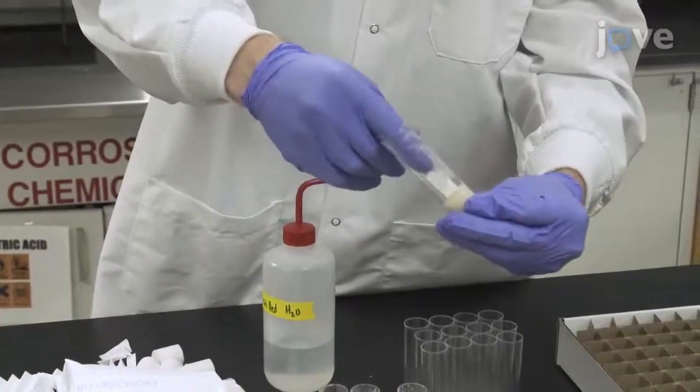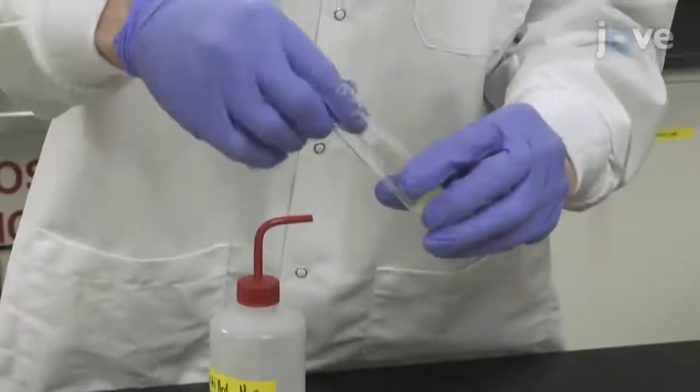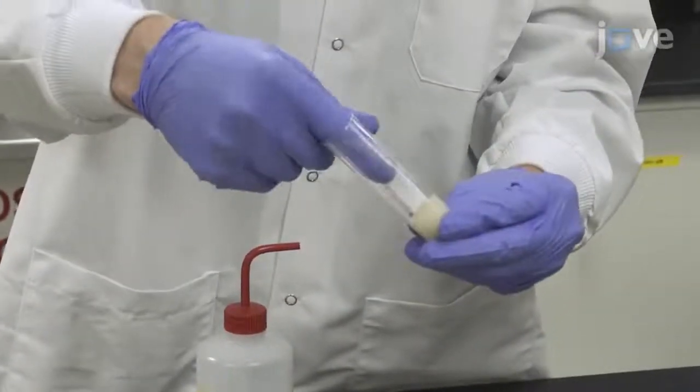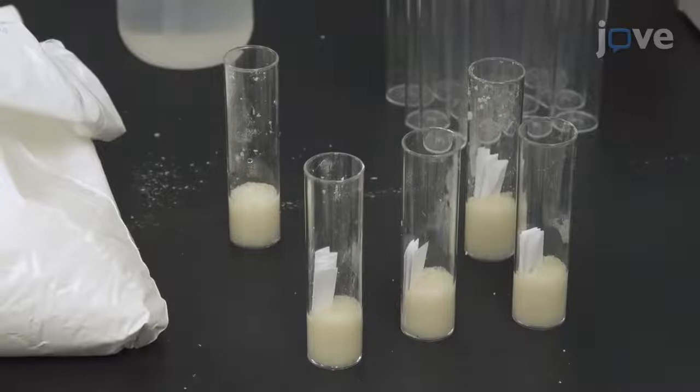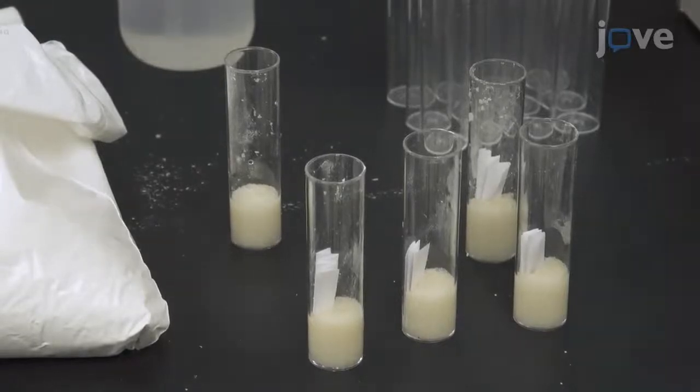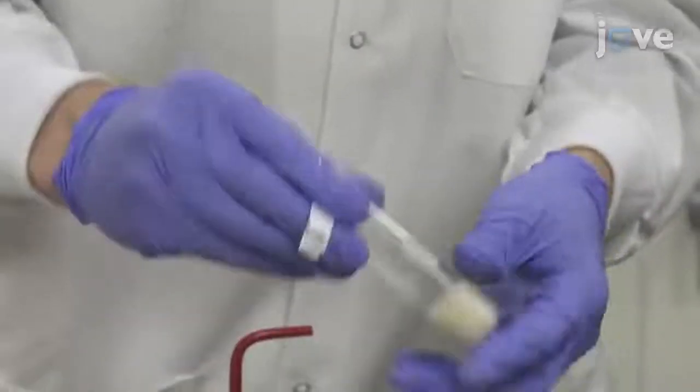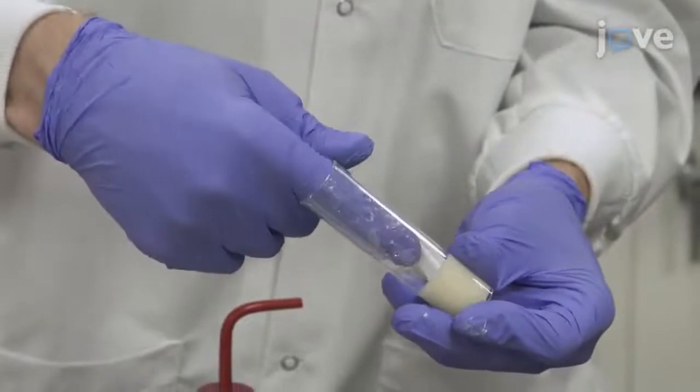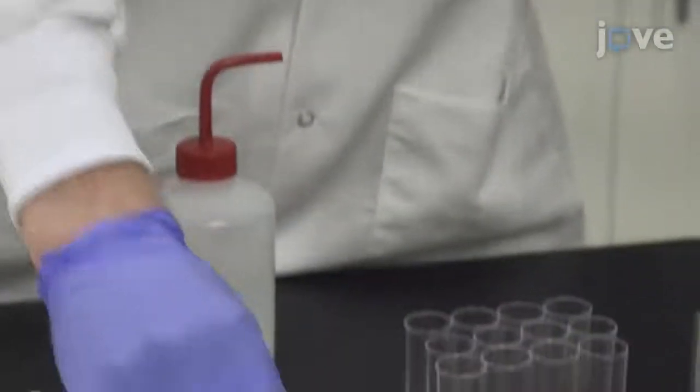Next, prepare the growth medium with the compound at the desired concentration. For instance, add the compound in the water aliquot when making instant medium. In parallel, make control medium without the added compound.